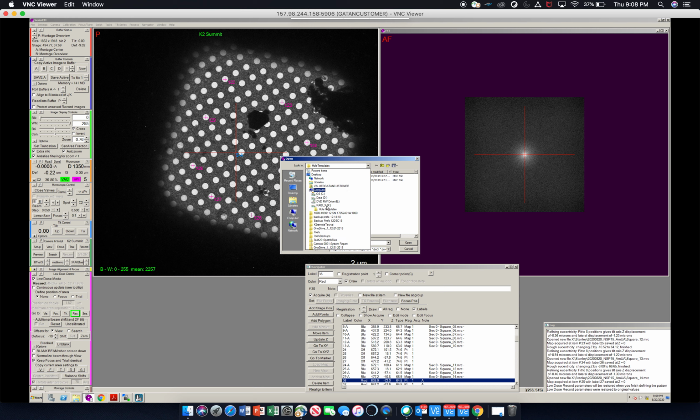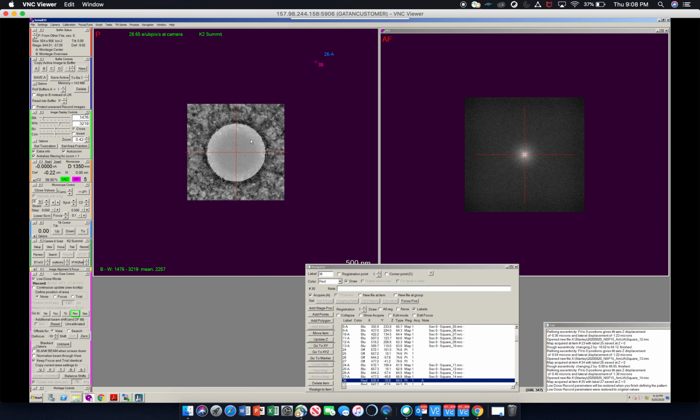So I usually go back to the original reference image I have, which is going to be in your working directory. So right now we're working under Stanley, and then MUA, and then we saved it as P, and that will load that.